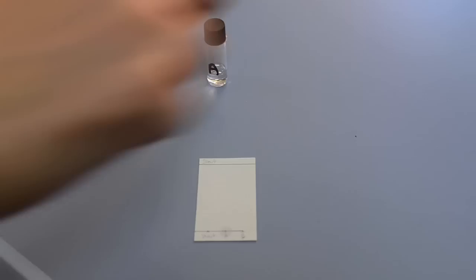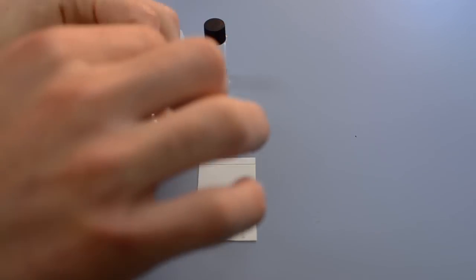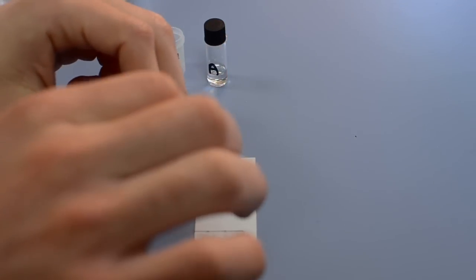While you are doing this, keep your eye out for any new spots or any starting materials which have become depleted. Generally, it is best to stop your reaction once your limiting reagent, the one present in the least amount, is depleted.